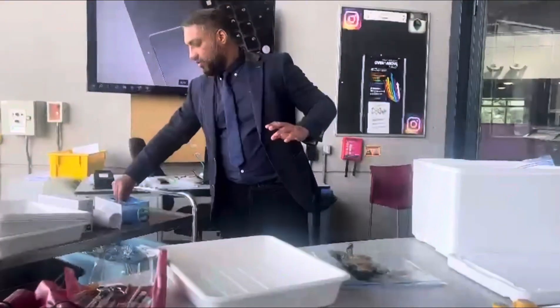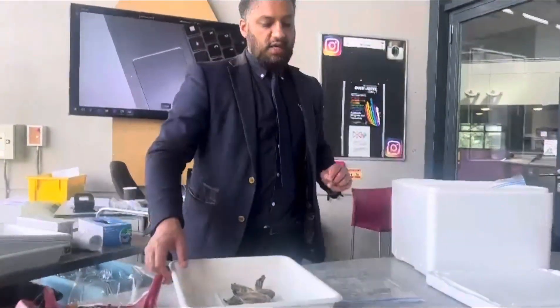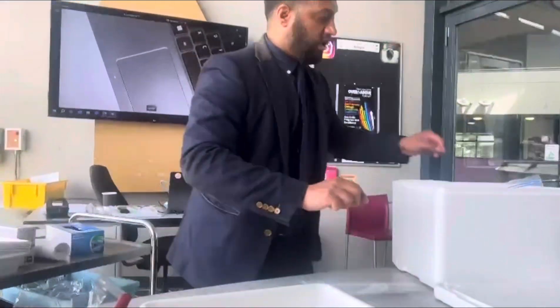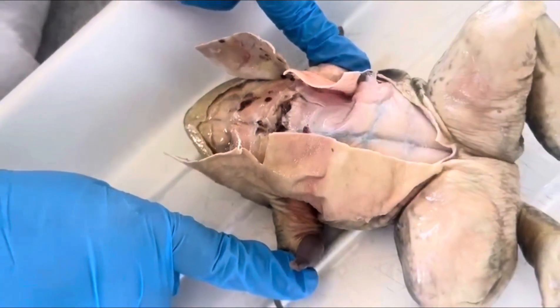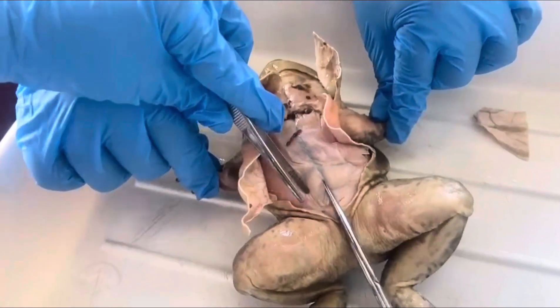Honestly, absolutely amazing. So what I'm going to do now is show you how to dissect it. You just need to listen for about five minutes or so and then we'll just go from there. I'll give you a dissection kit each. Dissection kit, frogs — I'll leave one on each table. What I like is for you to start cutting it open and doing what you need to do. This one's a huge one — look at that. It's going to dance just a little bit.